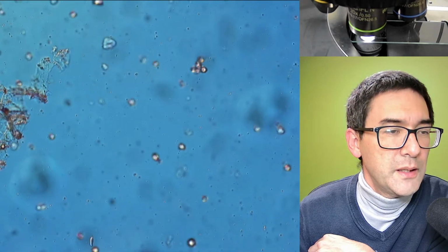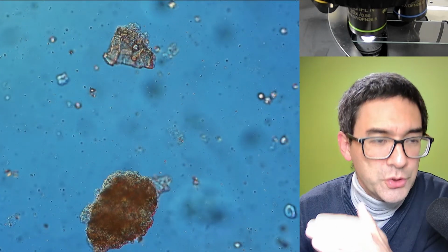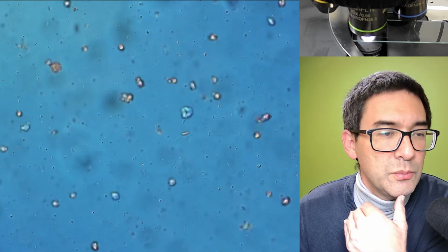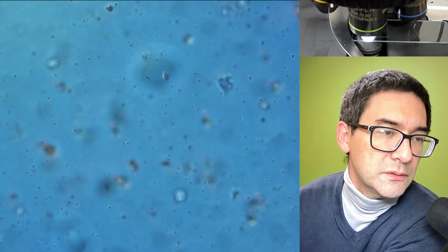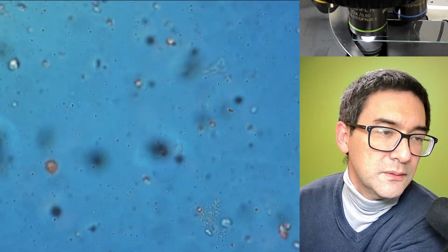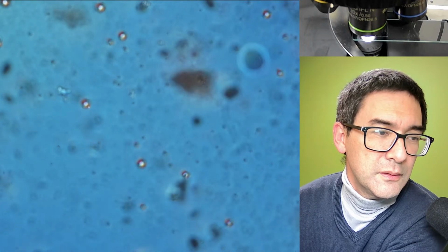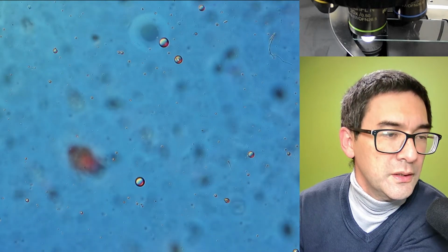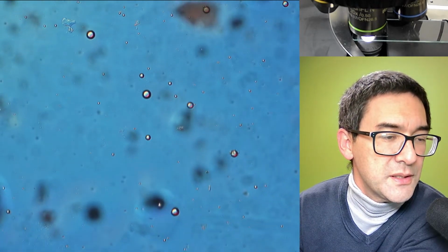So at the beginning there were fewer of them because of the liquid, which kind of pushed them away, and now that they're able to freely move again, they seem to be going back here, and they don't seem to mind at all. You see again those round globules of oil, which is actually an indicator that indeed there is quite a bit of the substance present.